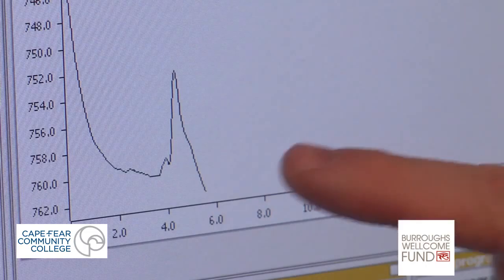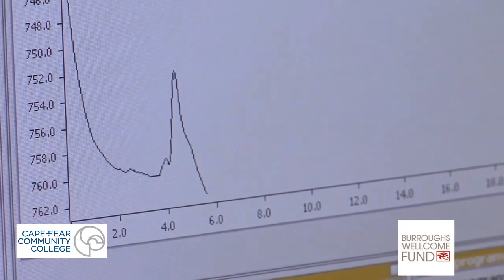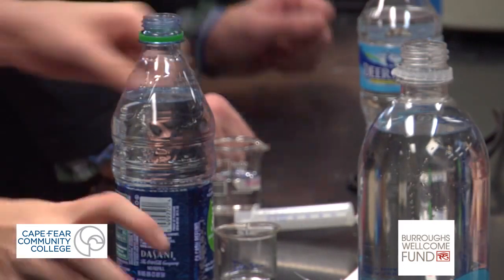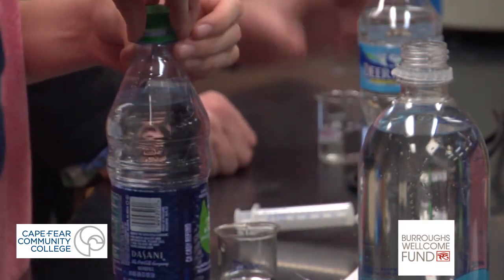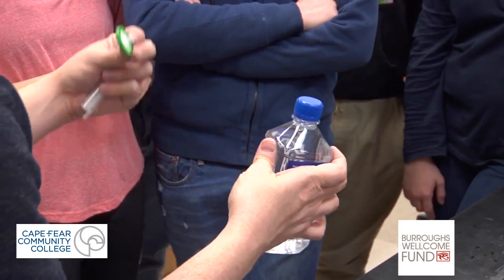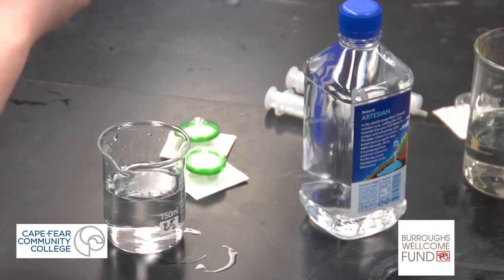So once we got all the results from the samples we put in from the Fiji water and the tap water, the Deer Park, Dasani, Smart Water, we took the numbers and we plugged them in and we made a regression line. When we looked at the results, we found that Smart Water and Dasani were at the bottom with the least amount of minerals, and then it went to tap water, and then to Deer Park in second place. Fiji had a significantly greater amount of minerals than any other water. It kind of just ran over the rest of the field in terms of how much it actually had. So the one that had the most of the potassium, the magnesium, calcium, and the sodium was Fiji water.